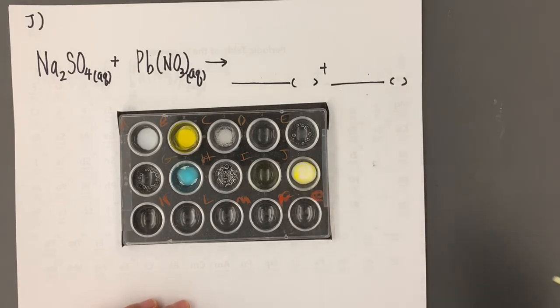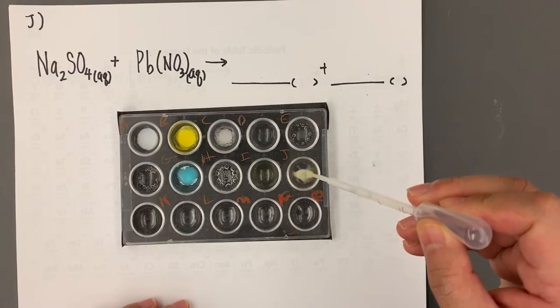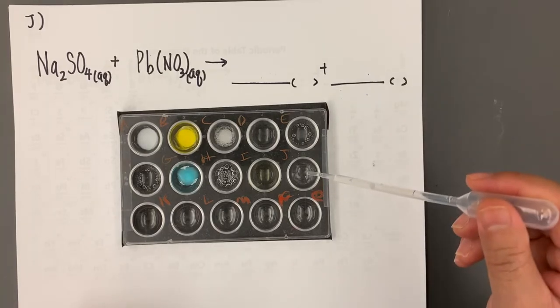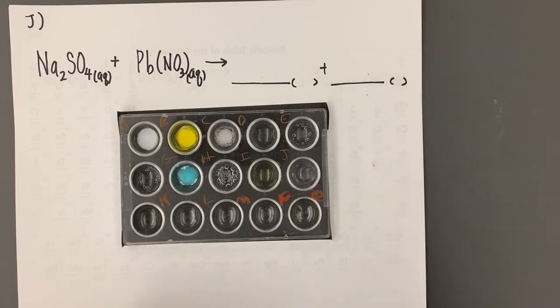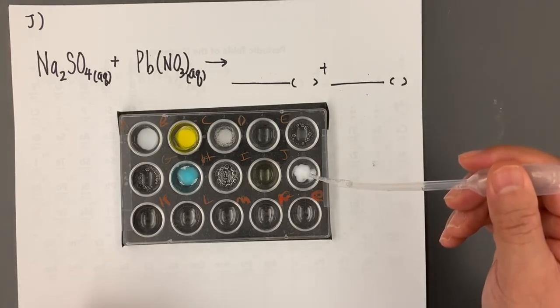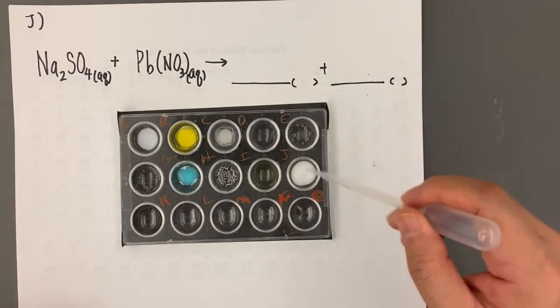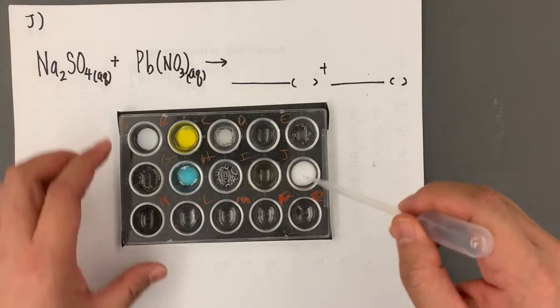Oh, I shouldn't have used that. I'm going to redo this because I grabbed the dirty pipette. Let me do it again. I apologize for that. Always watch out for what you grab in lab. It could be a dirty pipette. And we have our lead nitrate, and let's mix it with a clean pipette this time. Again, we see a white solid there, or a white precipitate.